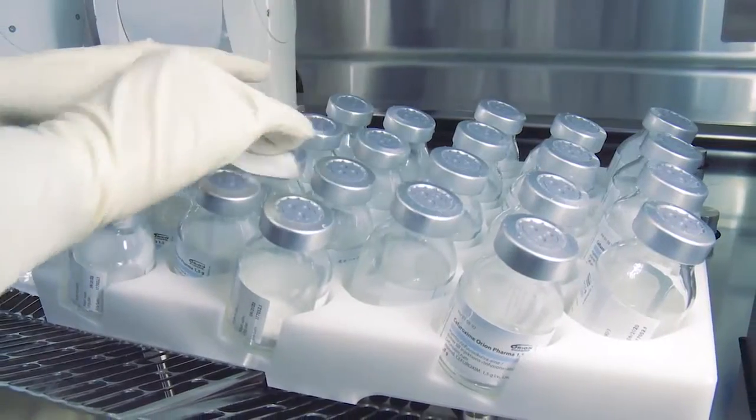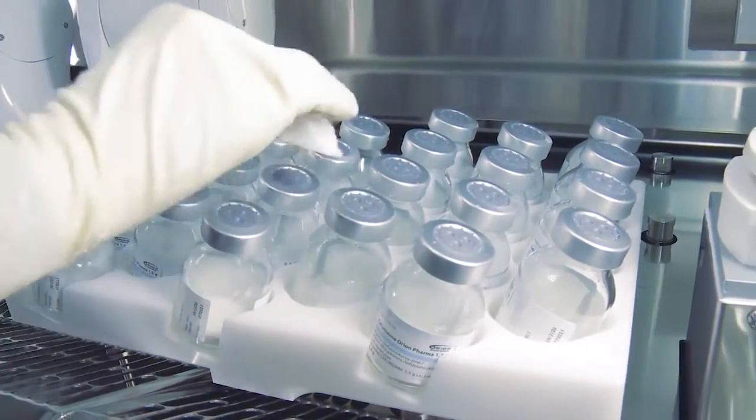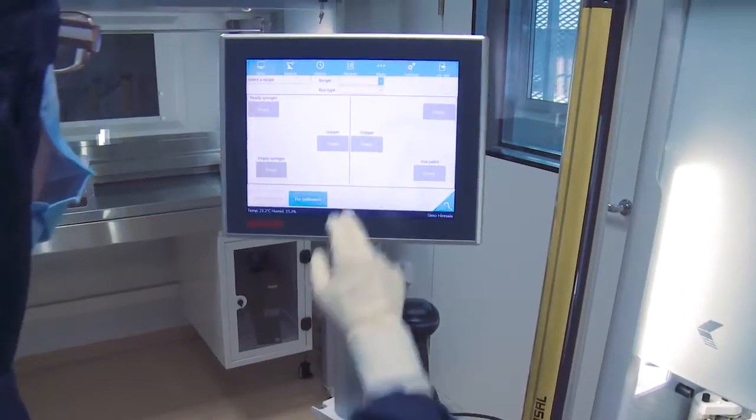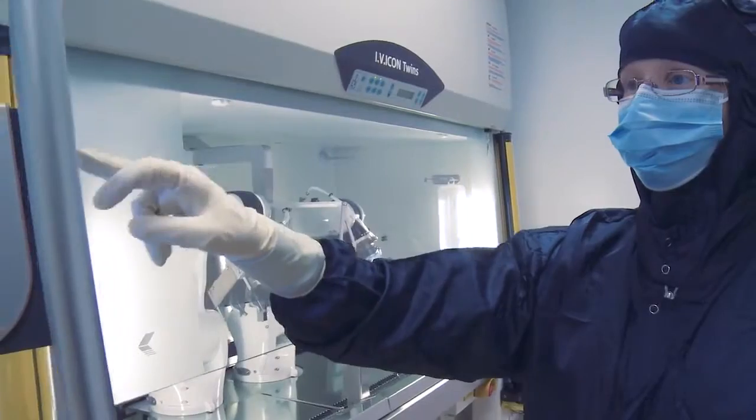The caps of the dose vials are wiped by hand. Once everything is ready, the robot is turned on.